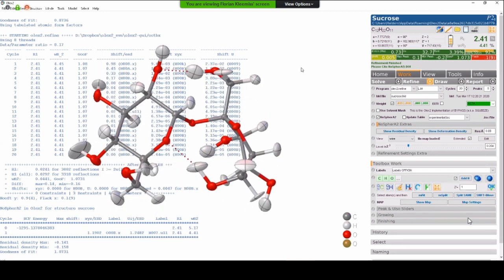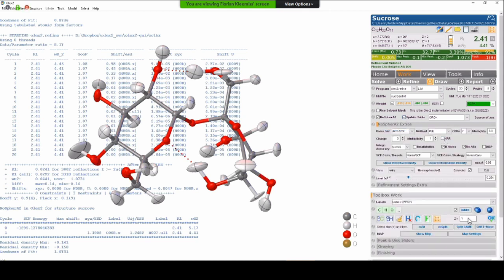But the point is, the scattering factors of this TSC file were calculated for atoms that were sitting in the previous position of the IAM. But now I shifted them away. So if I now relax the density to fit this situation, I will get an even better description of my structure, and I will improve my ADPs again. And this is the last button that I didn't tell you about yet.